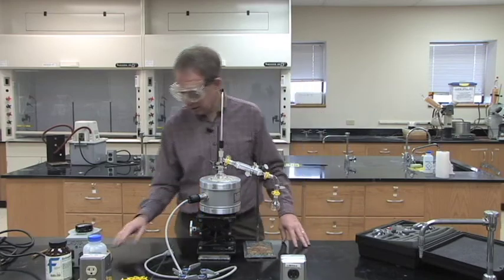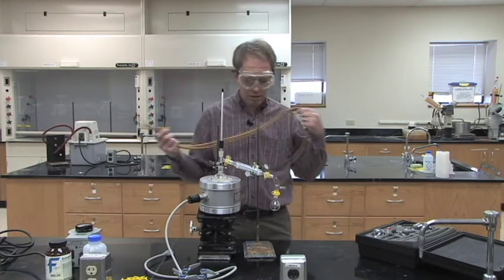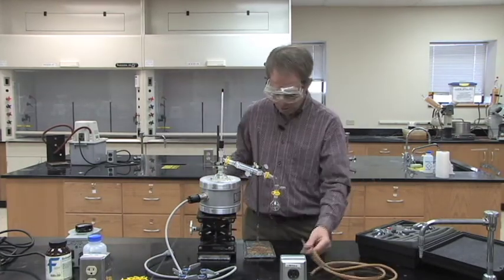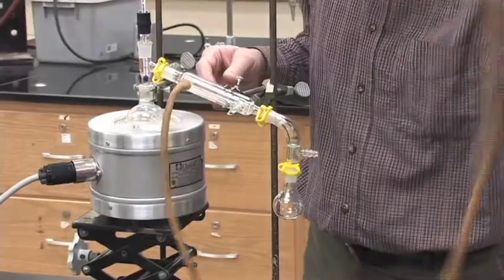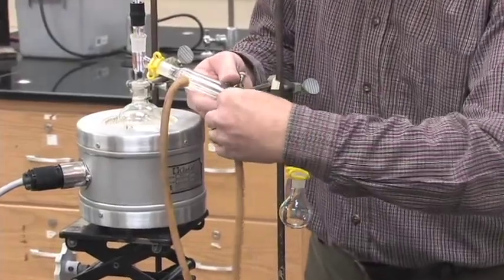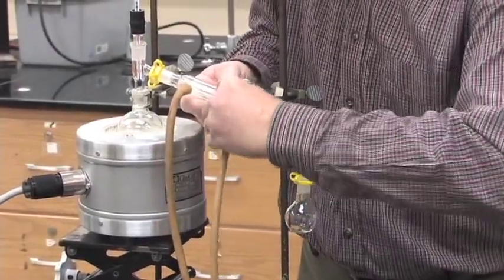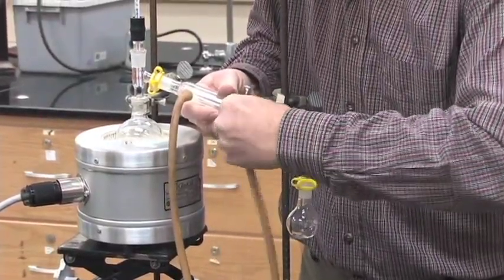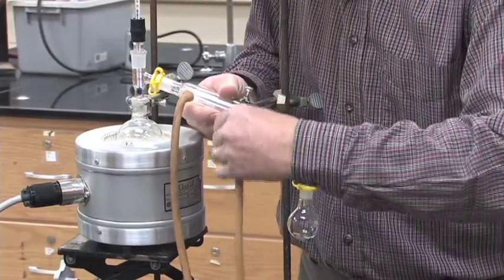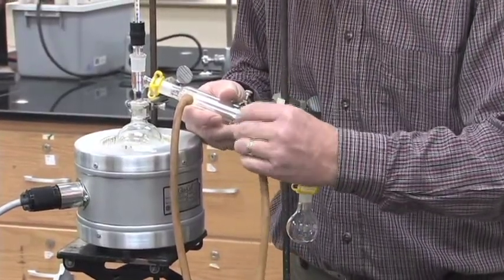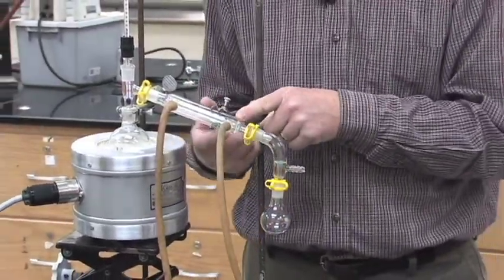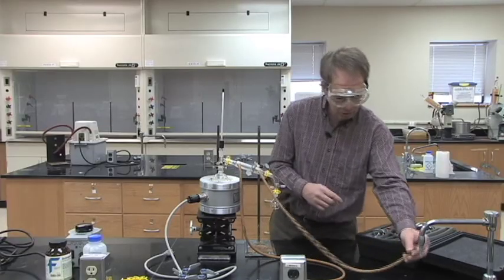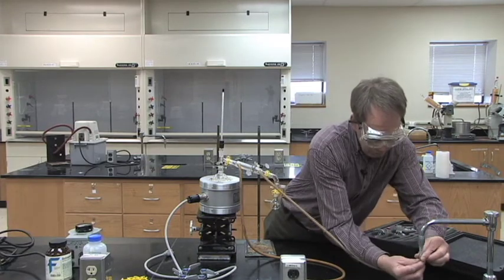Now when we do a distillation, we need to have hoses sending water into our condenser. Push the tubes on as far as you can on both of the ends of the condenser. Make sure they're on good and tight so they don't fall off. And then what you'll do is the lower end of the condenser will be the hose that goes into the faucet.